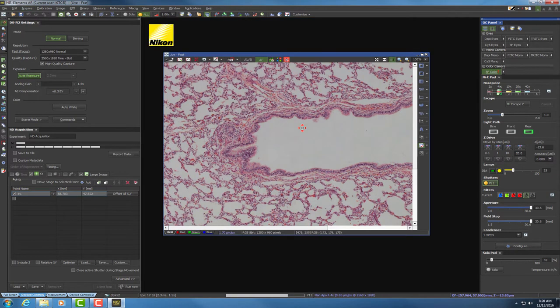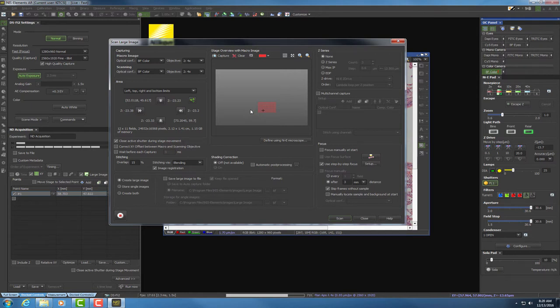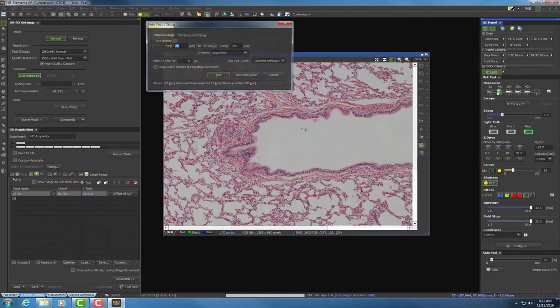Now we can start our tile scan. Go to the upper left-hand corner, hit Acquire, and go down to Scan Large Image. Make sure the capturing device is on Brightfield color and the objective is at 4X. We'll set the top, bottom, left, and right coordinates for the microscope to scan the tissue. I recommend setting up auto-focusing because the tissue doesn't lie completely flat on the slide — this helps compensate by focusing every time you take an image. You can set it to focus every frame, every other frame, or every three frames.